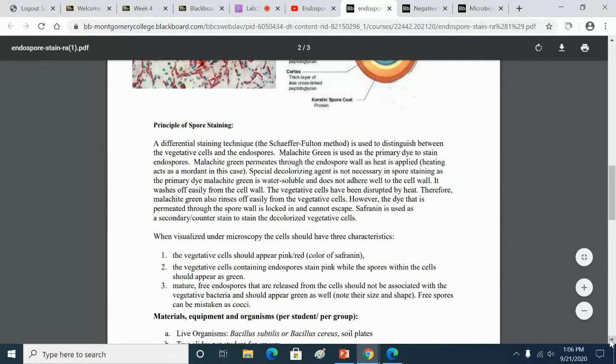Now, just as with the acid-fast stain, the hot plate gets covered with stain, which means the bottom of your slide may be covered with stain. So here you are allowed to wipe the bottom of the slide. So you can use the 95% ethyl alcohol or the green lens cleaning solution and clean the bottom of the slide. Not the top, never wipe the top, but the bottom of the slide you can clean in case it gets all dirty.